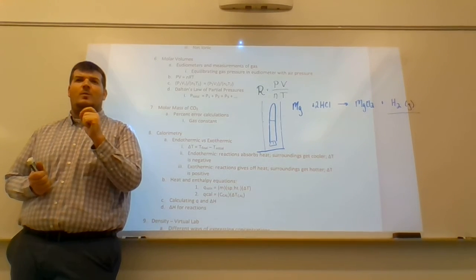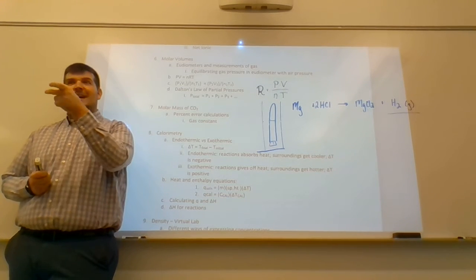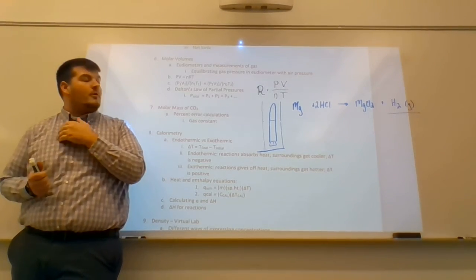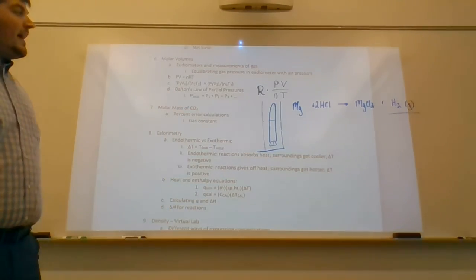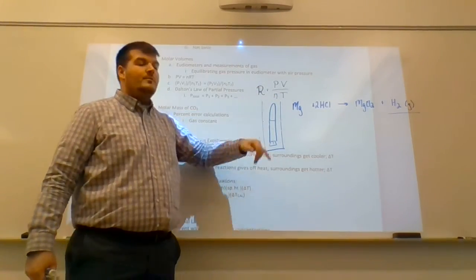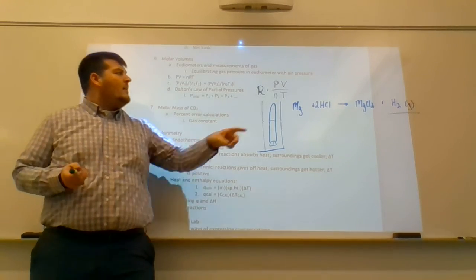Remember, vapor pressure of water will change with different what? Vapor pressure is temperature dependent. So in this case, you guys read the temperature of the room, which is good because we needed it anyway. So you read the temperature of the room, and then after you did that, you took the pressure that you gathered from the room, made sure that the levels were equal, then subtracted out the vapor pressure of water at that temperature. Now, volume.